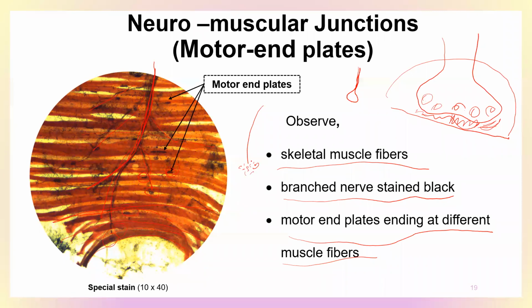So the nerve fiber and these small dots, okay? You can call this a terminal bouton also, or the motor end plate, or a neuromuscular junction. So a junction between a nerve and a muscle, right? Skeletal muscle and a nerve fiber. And in this area, you have these membranes here. So this gap here is called a synapse.